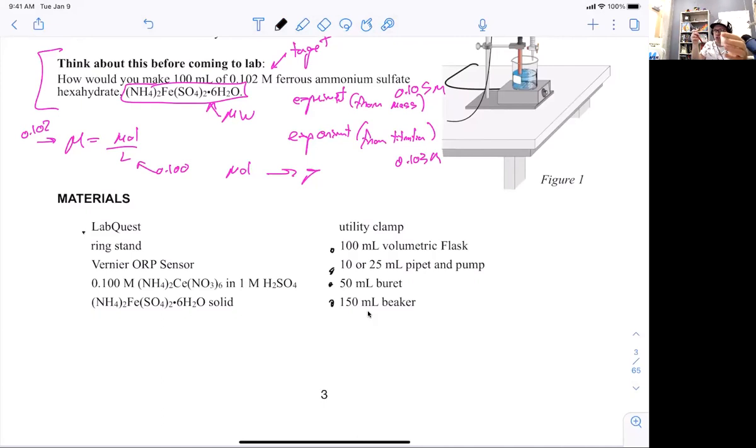I'm going to ask you to rinse these out, but then make sure we put in fresh buffer solution to fill it back up. And you want to rinse it really, really well with water. So you're going to get your little wash bottle and kind of hose it down. Then you'll get one of those Kim wipes. They're in little green boxes in the lab, and you dry off the outside. You just pull straight down.